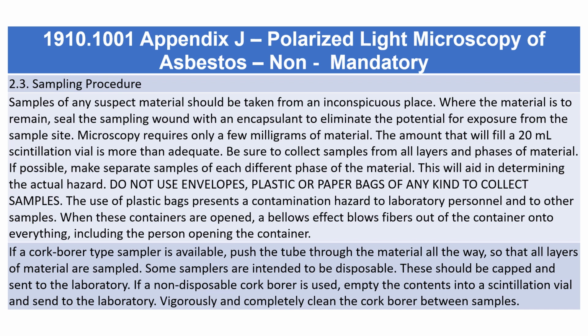Some samplers are intended to be disposable. These should be capped and sent to the laboratory. If a non-disposable cork borer is used, empty the contents into a scintillation vial and send to the laboratory. Vigorously and completely clean the cork borer between samples.